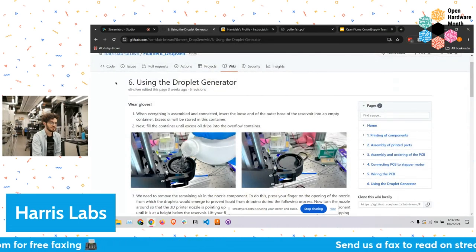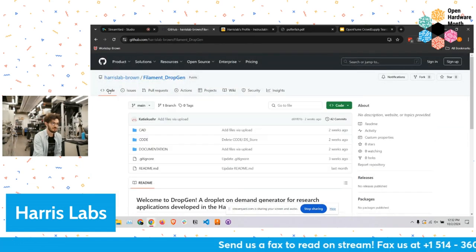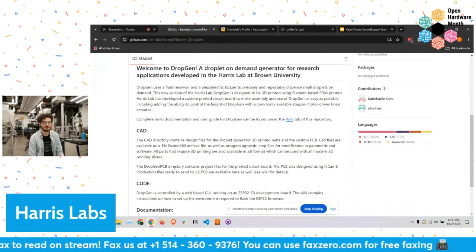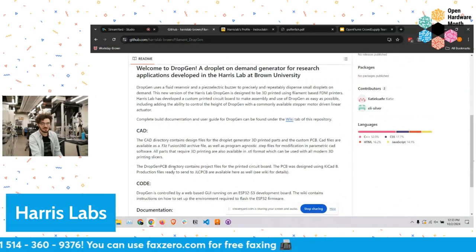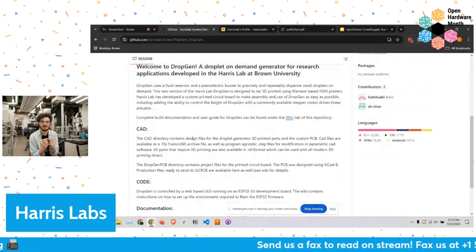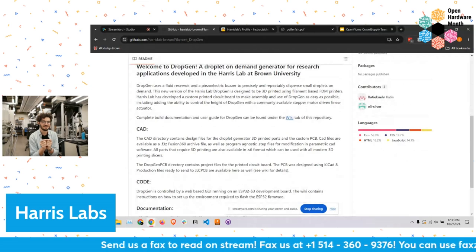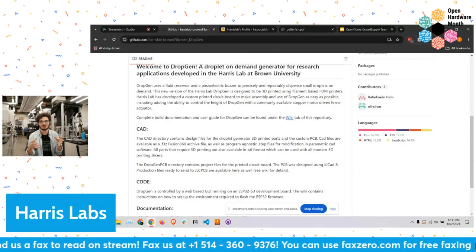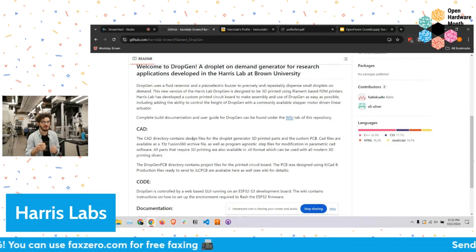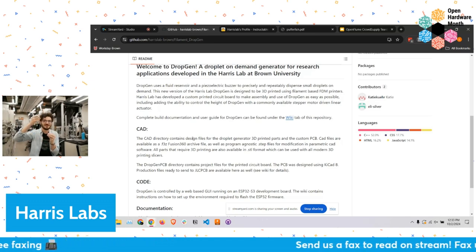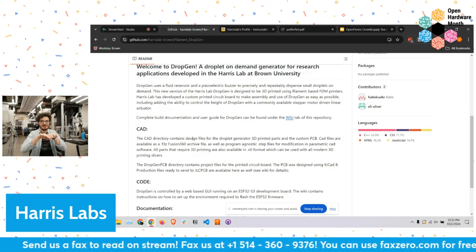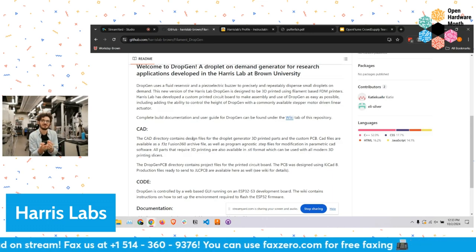So the droplet generator — one of the Open Hardware projects that has been replicated at labs around the world because of how useful it is and hopefully how easy to build. We use it for oil and water droplets. It's difficult to make droplets smaller than about a millimeter, which is kind of the smallest size you can reliably make with the traditional method — dripping fluid through a syringe needle or something like that.